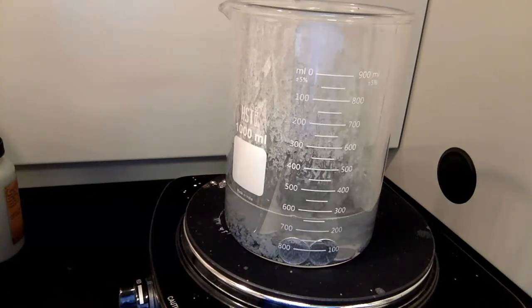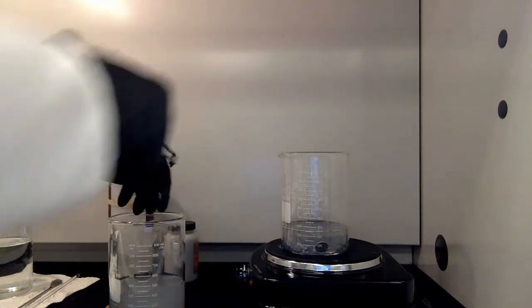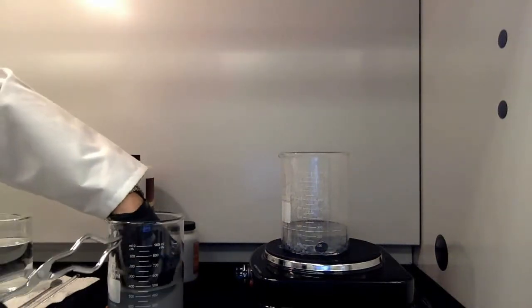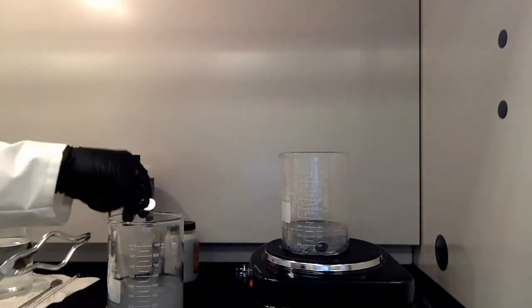In just a moment, we're going to remove that penny, rinse it off, and then we'll begin the heating process, which will allow the blending of copper and zinc. So now I'm going to rinse this penny off, and I'll even use my fingers a little bit just in case there's any zinc residue on the outside, and that should be good.